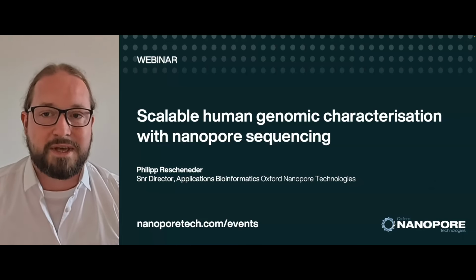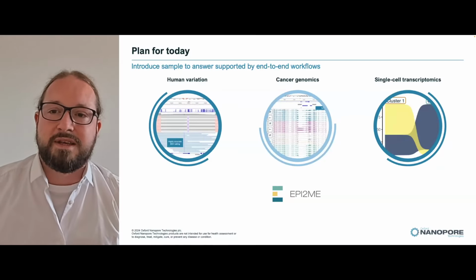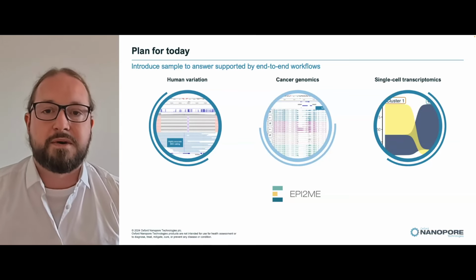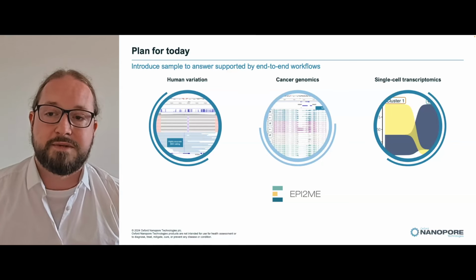So what's the plan for today? Here at Nanopore, lately we have had a strong focus on providing end-to-end workflows, basically from sample to answer. And today I just want to give you an overview of three of those, focusing around human genome sequencing.